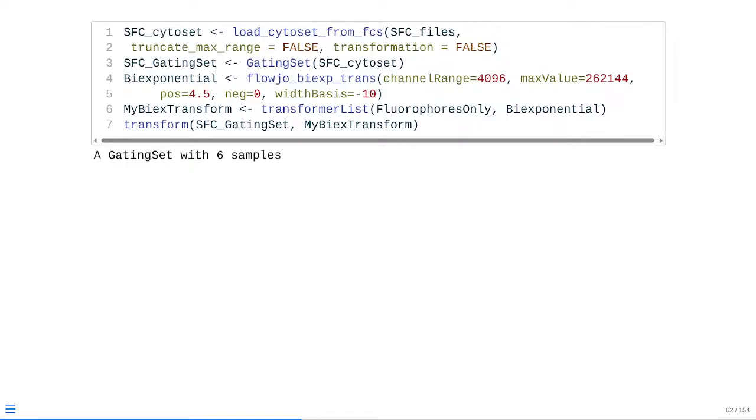So one thing I find much easier to do is just basically go ahead and reload in the entire data. Go ahead and reload in the entire gating set. The reason for this is those pointers that had been created to the original location on memory end up getting deleted, and you're then able to create a new one right on top of it.